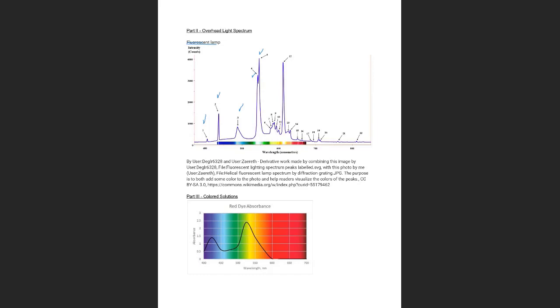Here is the wavelength. So you know this is 400. Look carefully, and for me, let's say I wrote this in nanometers, for the peak number 1, I wrote 406 nanometers. You will write approximately your number. So when you look at this scale, you will have to identify exactly this peak.